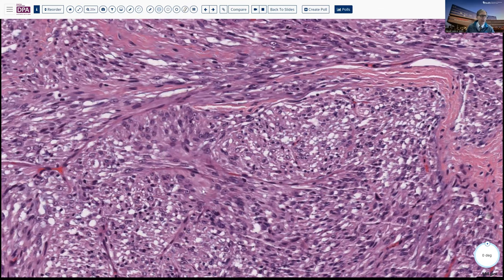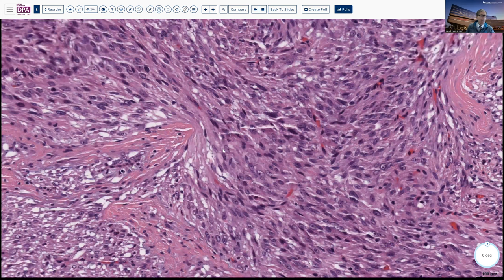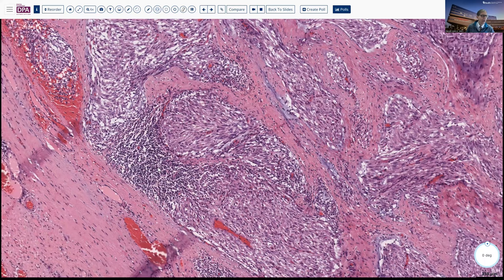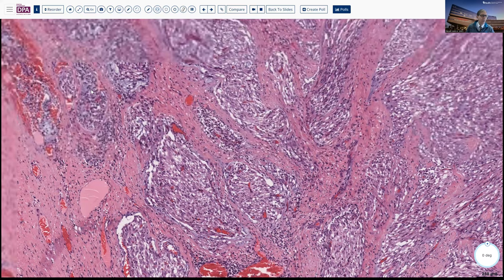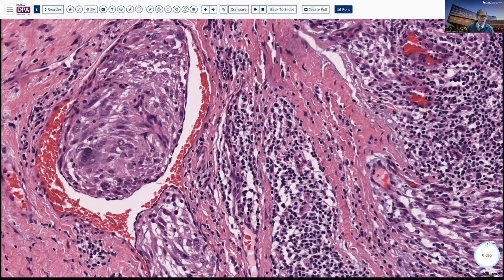No necrosis is identified, and we can find mitotic figures fairly frequently. Additionally, at the periphery we can see this lesion has a perithelial pattern — it sort of grows around in nests. We can see intravascular extension or involvement of these areas here, and in other areas more clear-cut lymphovascular space involvement. It's always growing in these nested, budded fashions. Here we see some almost multinucleate type cells, and there's a little endothelial lining over some of this, giving it this subendothelial pattern of intravascular extension.